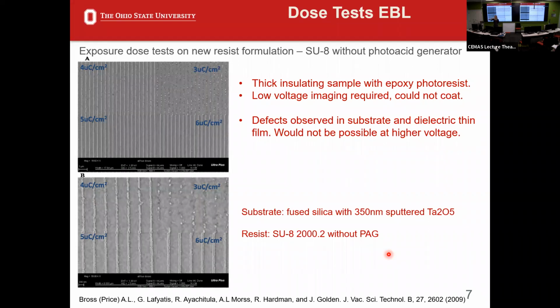So you step right back up or down, depending on which way you came from, and that's your neutral point. So if your sample was charging right after that contrast flips or inverts, then you should be right at the charge balance point. So your charging should minimize or reduce. You probably already knew that. I did not know that until I actually saw it in action, and it's very cool.